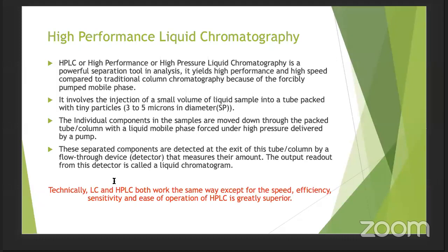So it's very difficult for the solvent or the components to go through it. This is why a high pressure is applied, so as to push your mobile phase along with the component through that column. Due to this, a rapid and effective separation of the component is done. Approximately 1000 to 4000 psi is the pressure that you usually apply in HPLC.